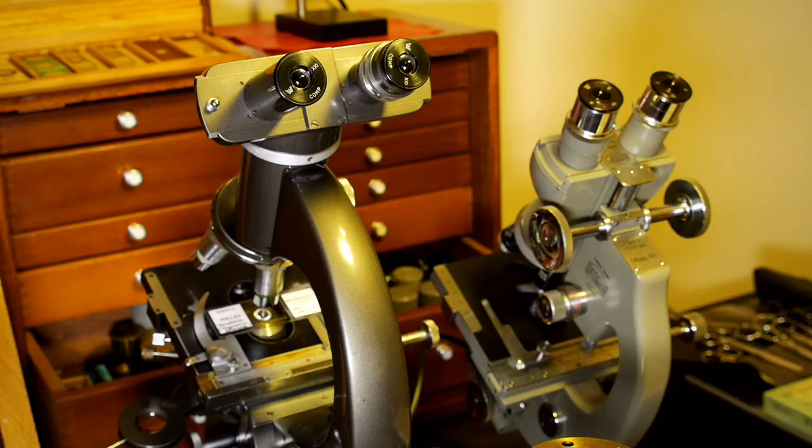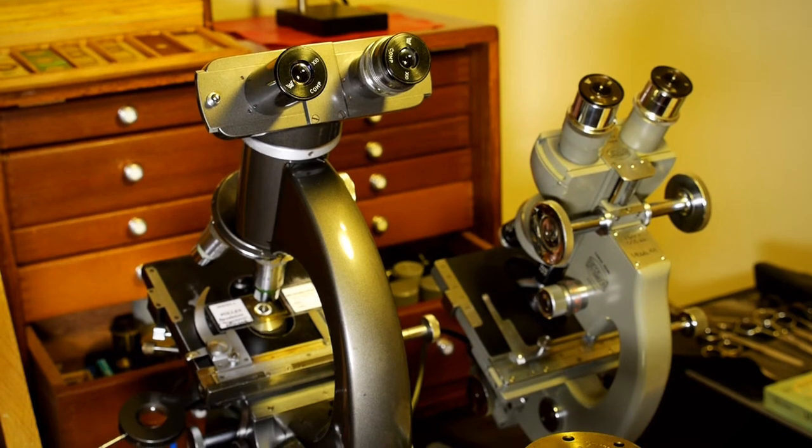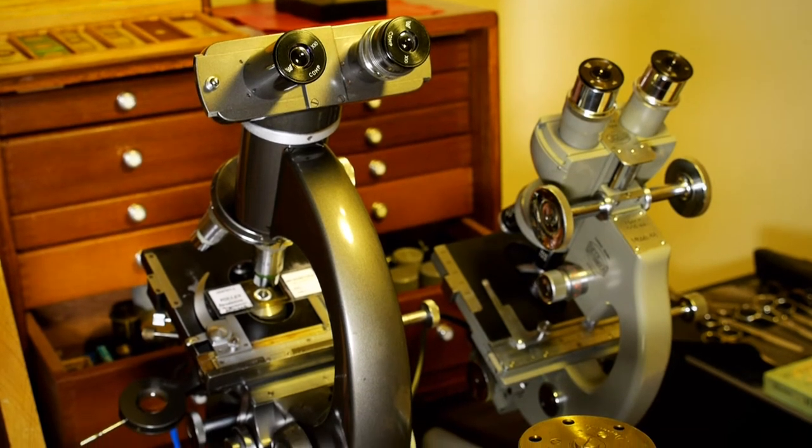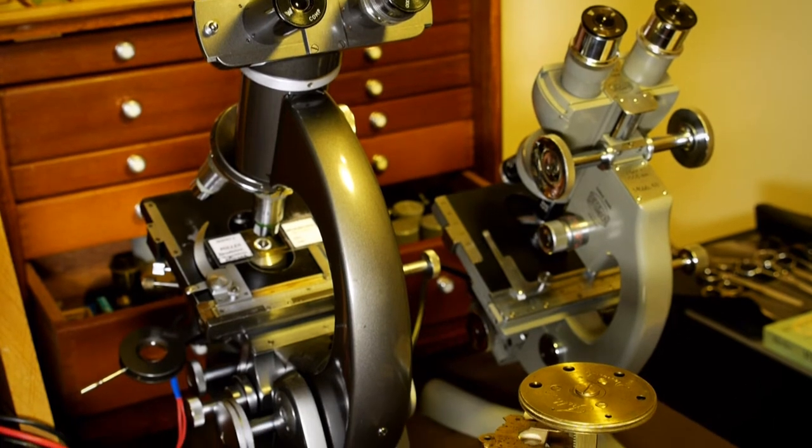It has taken just over 750 years to develop the optical microscope as we know it, from its early beginnings as a green glass monocle.